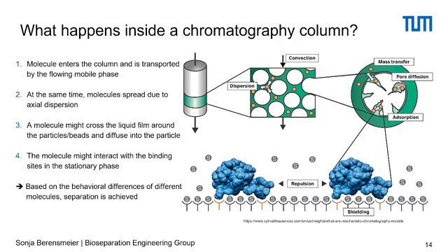They can move around, but they can also interact with the surface of our particles and can come to adsorption, which means that the molecule is binding to the surface. As you can see here in this last zoom stage, the molecule is binding to these ligands on the surface of our adsorber. And then the last stage that is sometimes looked into is the movement of the molecules on the surface, right? So molecules bound on the surface might interact with other molecules bound on the surface. They might move around, change their binding spot. They might have a repulsion so that there's always some space between them.